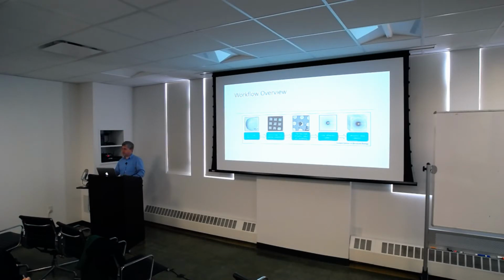2D crystallography is probably the hardest technique, I would say, in EM, because it's sort of the least worked out. The software is, I would say, the least mature, although there has been a lot of work to make it more user-friendly. I remember some of the unit cell constants used to be in the Fortran code itself, so you had to know the code and reprogram it for your crystal. But I'm sure it's better now. With Henning, they've written 2DX, which was a lot better. That was about 10 years ago.